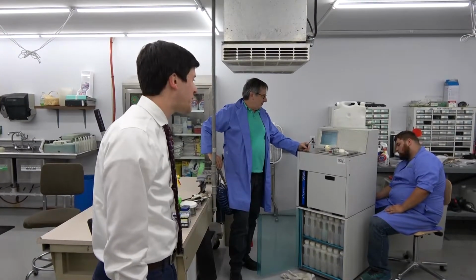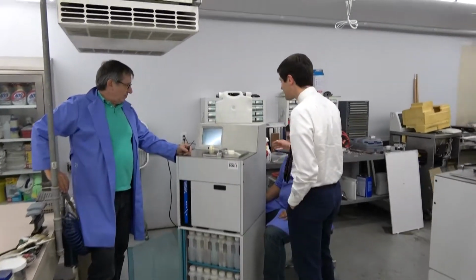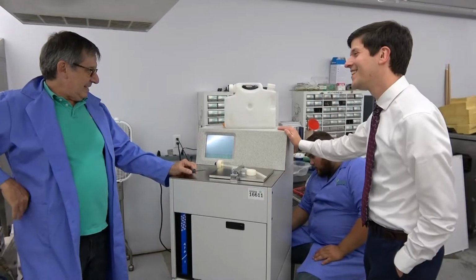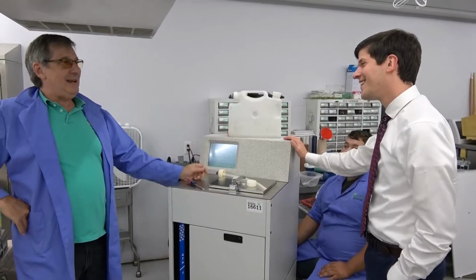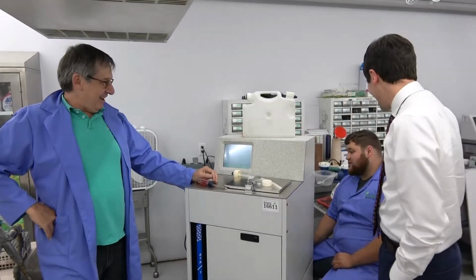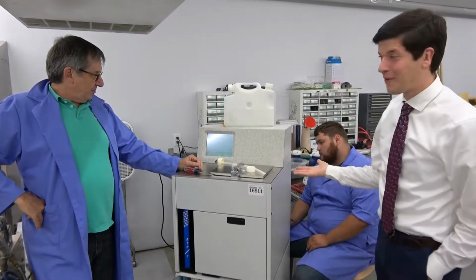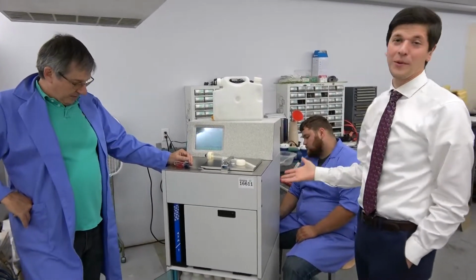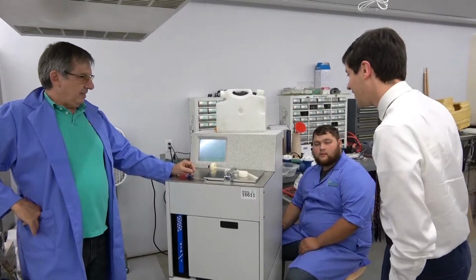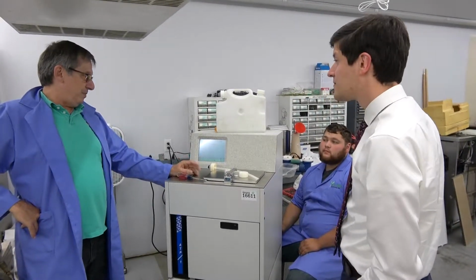Now, tell me how happy you are to be working on a Triangle Biosciences tissue processor. Tell me one thing good about this tissue processor. It's got a real easy name to remember. It is very inexpensive. This isn't our favorite brand, but they're a very affordable option, even compared to a 30-year-old Sakura 2000. They use a lot of off-the-shelf parts, which should make repair easier.